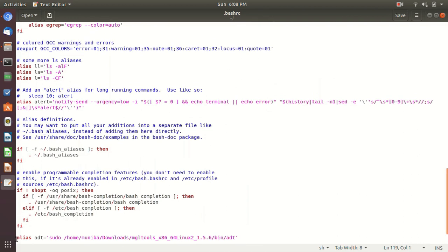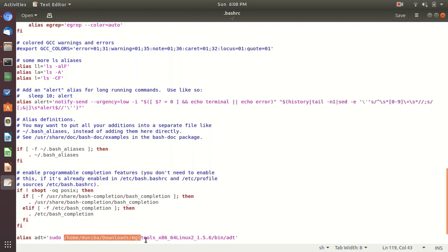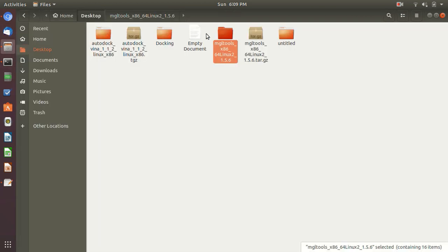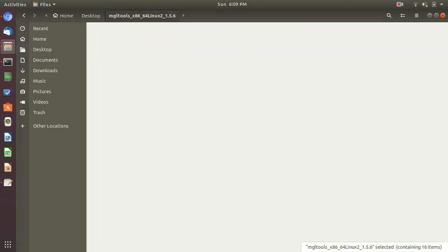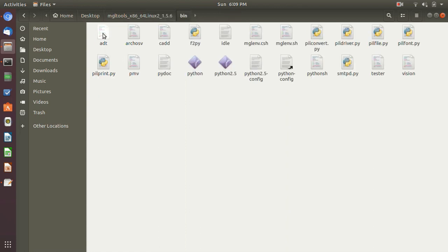ADT is for AutoDock Vina. And here you can name it anything, whatever you want. Okay. So it says ADT, and with a single quote, type sudo and your pathway to the bin ADT file. And let me show you the bin ADT file. Okay.